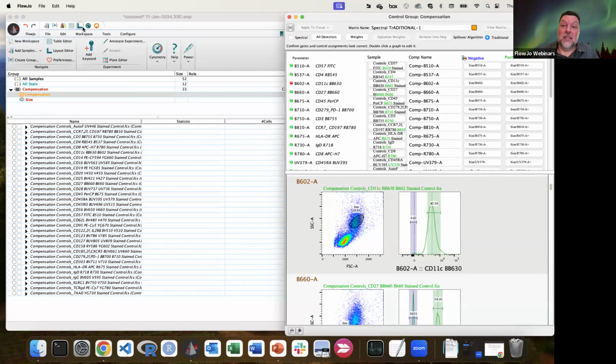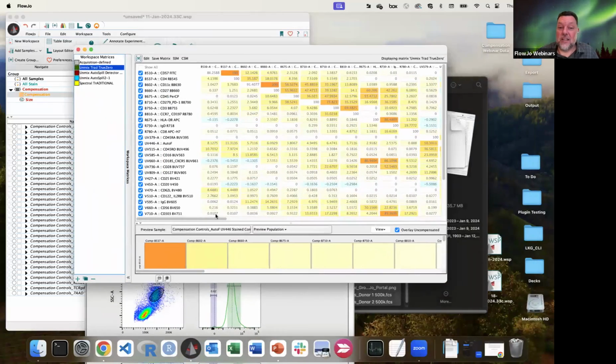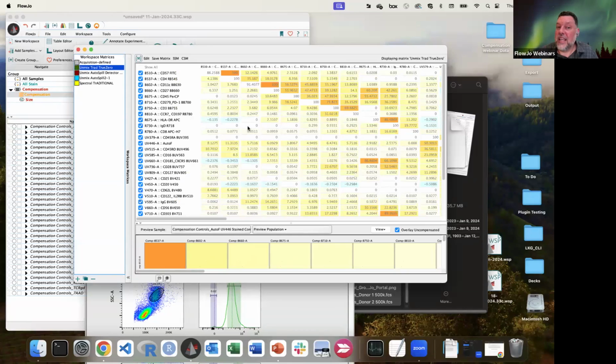And once you have this compensation matrix created, right? Again, it's 33 by 48 here. I can't edit this. I mean, it'll allow you to edit the matrix. It'll make a copy and you can tweak the numbers, but you don't know how you're really affecting the overall state of the cells. I know you want to just make it straight, not skewed, or maybe bring what's negative up so you don't have a negative MFI. But the math is correct underlying it.